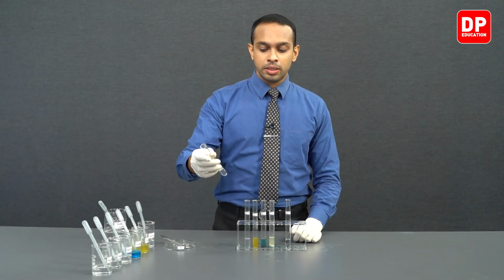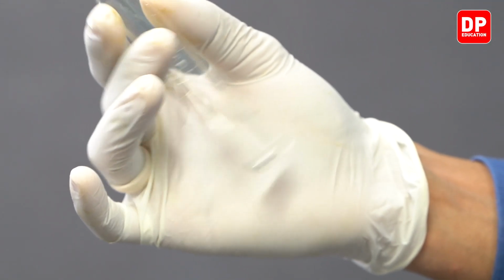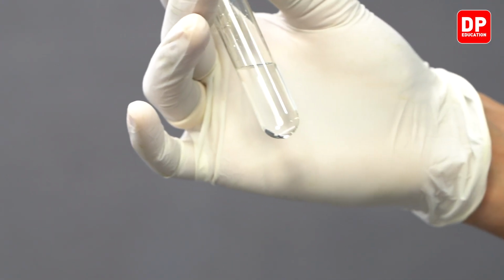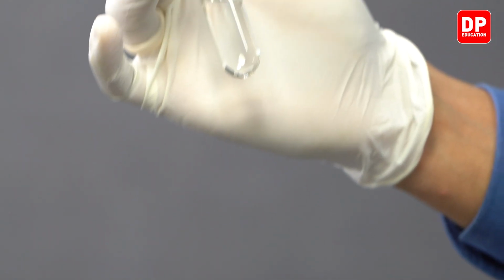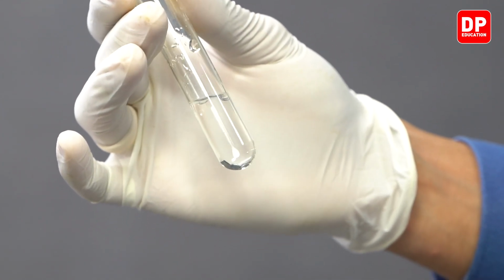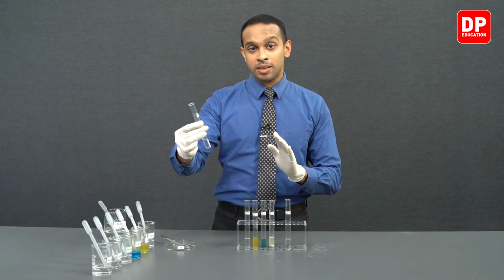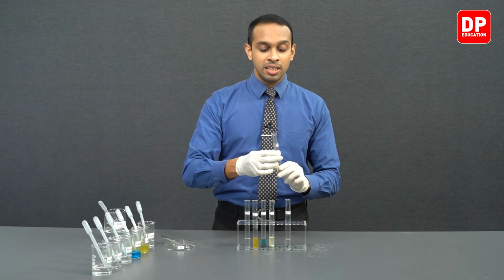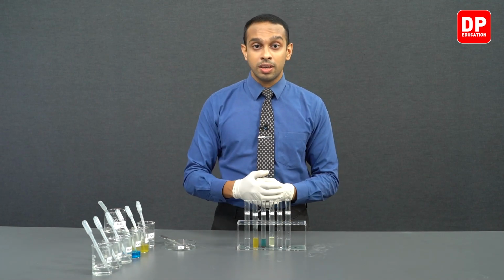In the Mg2+ aqueous ion solution, do you observe a color change or a precipitate that is formed? No. In a Mg2+ aqueous ion solution, when we add zinc, we do not observe any color change, or any precipitate formed. So this would indicate that zinc did not displace Mg2+ aqueous ions as magnesium solid. This means zinc is less reactive than magnesium. Magnesium is more reactive than zinc.